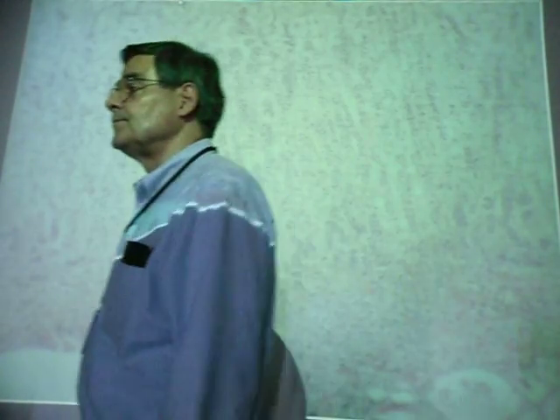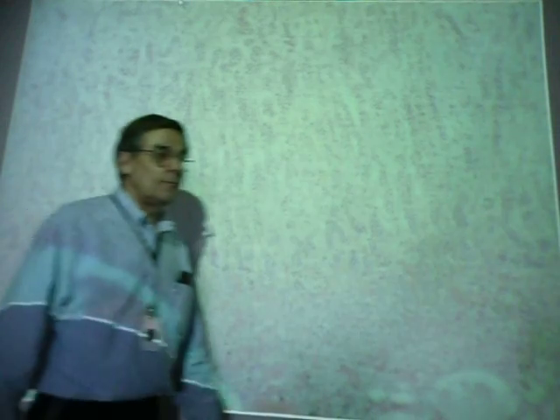Okay. Well, the bottom, right here? Yes. That again, you're looking at the medulla. And here you're talking about the chromaffin cells producing epinephrine and all that. And so you can just go through this from one side to the other. Here's the medulla again. No, we're going through the organ.